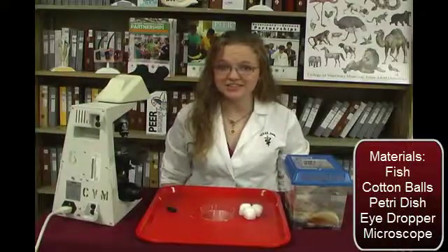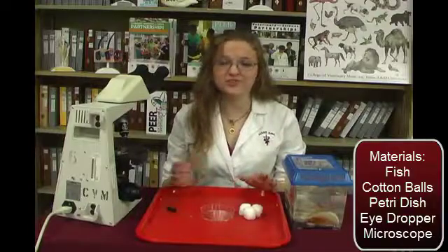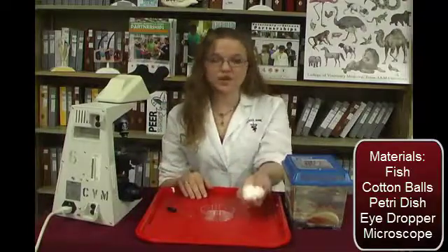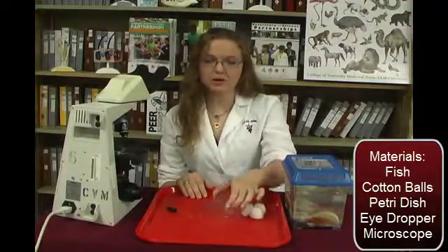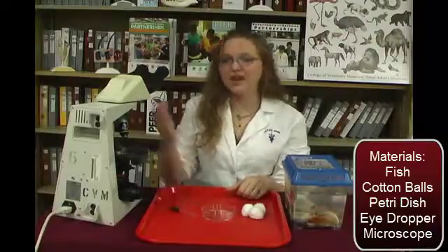The materials we need for today's activity are goldfish, preferably lighter colored goldfish so you can see the vessels easier, cotton balls, a petri dish, a medicine or eye dropper, and a microscope.